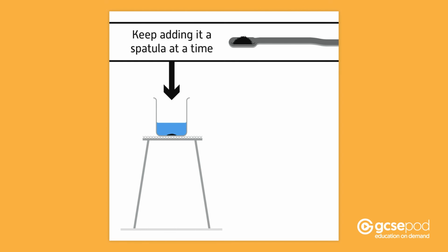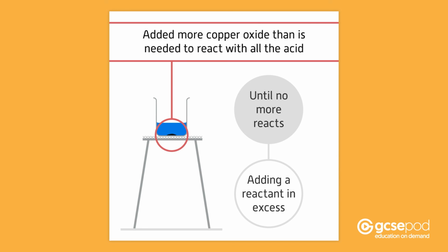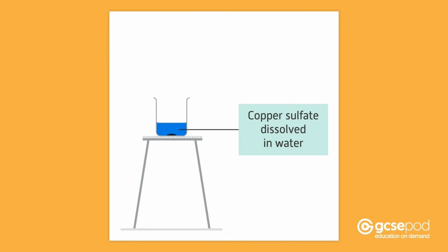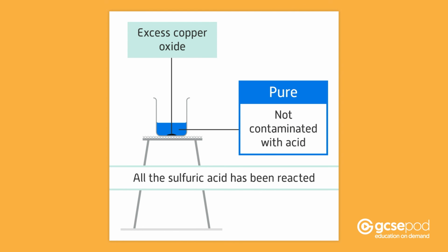Keep on adding the oxide, a spatula at a time, until no more reacts. This method is called adding a reactant in excess. You have added more copper oxide than is needed to react with all the acid. All you now have in the beaker is copper sulfate dissolved in water and the excess copper oxide. All the sulfuric acid has been reacted. Adding the copper oxide in excess ensures that the copper sulfate made is pure and not contaminated with acid.